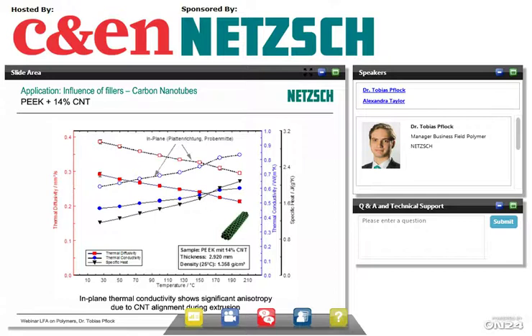And this plays a major role if you want to use different filler materials. Boron nitride is another example of an anisotropic material. So you have to check the anisotropy of your heat transport if you want to use fillers to adjust the thermal conductivity of a polymer sample.